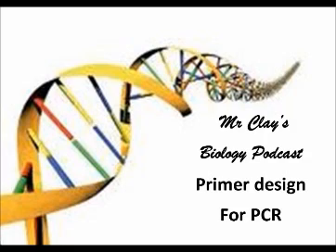Today we're talking all about designing primers for PCR. This is specifically to help those students that are working on Mr. Clay's 13biology.wikispaces.com and engaging in a primer design activity. So without further ado, let's get into some biology.